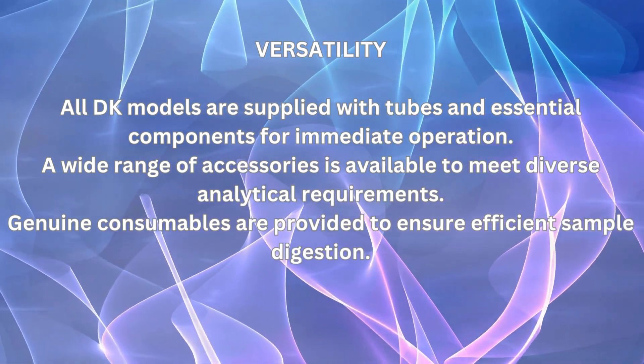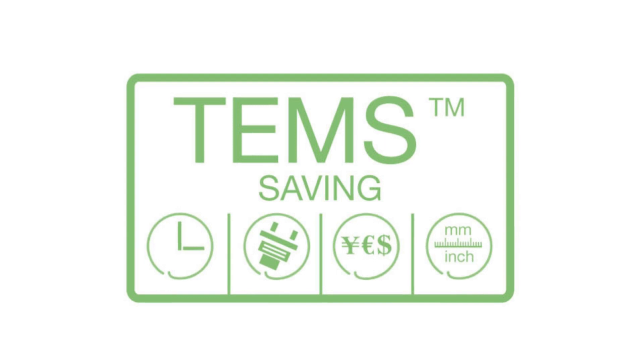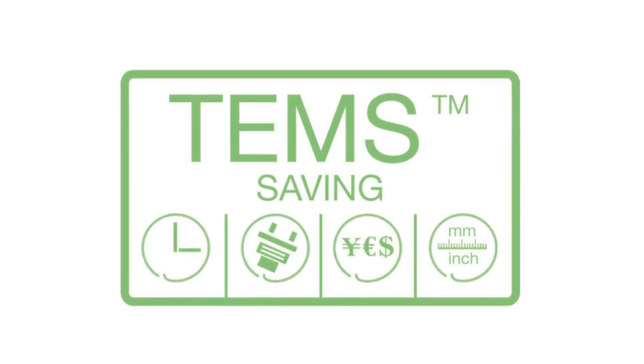Genuine consumables are provided to ensure efficient sample digestion. The DK series Kjeldahl digestion units work with the innovative TEMS benefits for huge savings: Time saving — rapid heating reduces wasted time; Energy saving — limited energy consumption, cutting CO2 emissions; Money saving — cost reduction for each analysis; Space saving — the narrow footprint saves valuable laboratory bench space.